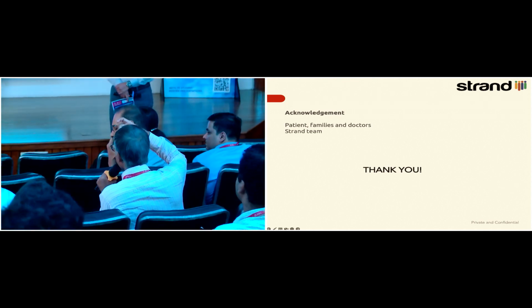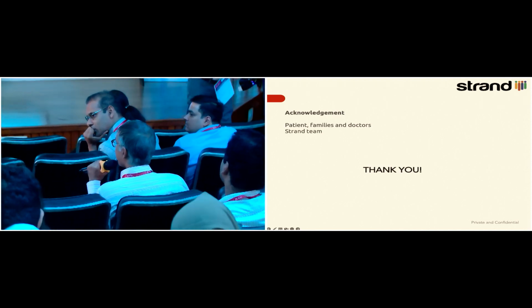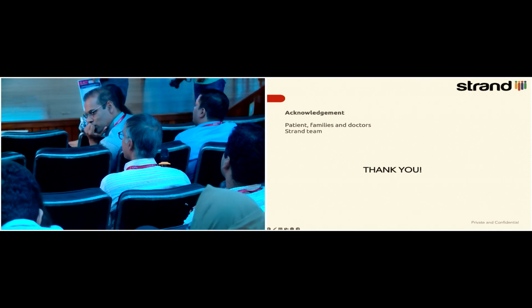So it seems like part of the problem is that you only do the measurement once, and then you're doing the data post-processing. And if one could put a feedback between those two steps, you could probably discern finer grained variations. That's a good point.